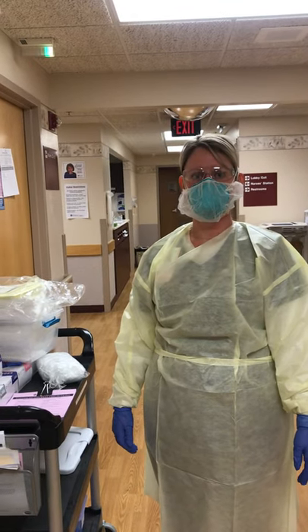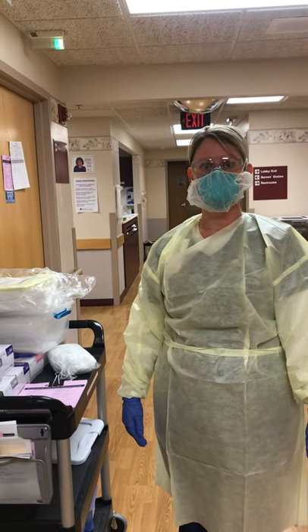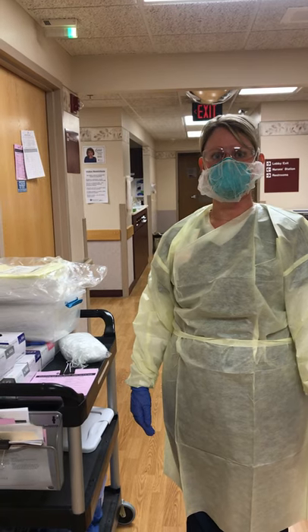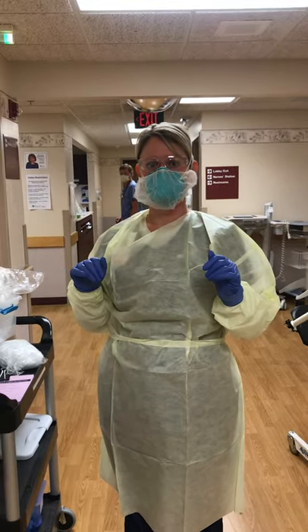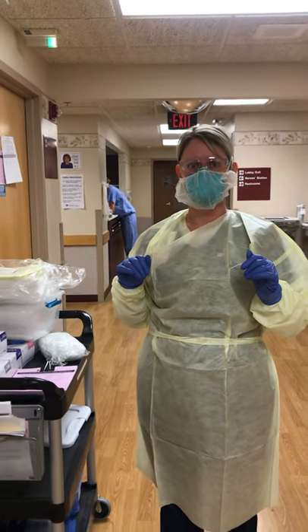This video is going to show you how to enter a room with your PPE on, and then we're going to show you how to doff without an anteroom.